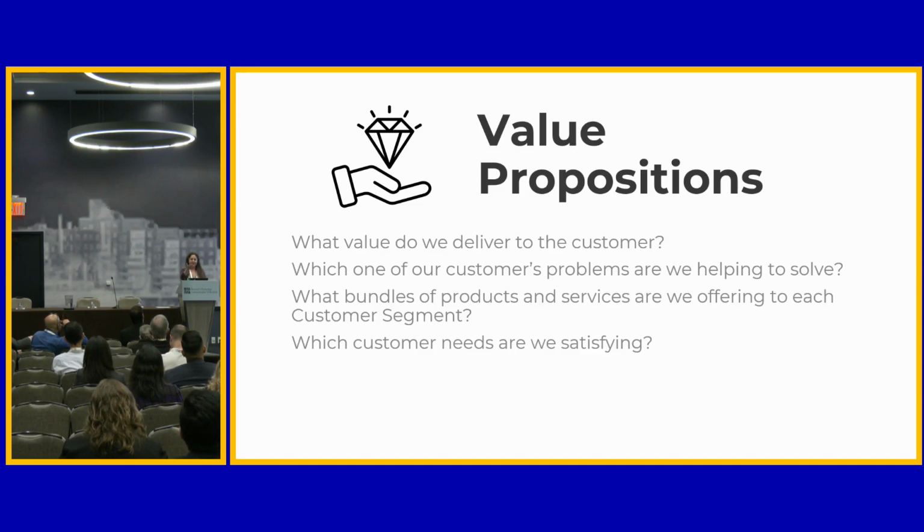We were talking about this, Barry and I, about how a product team and a services team really have to work closely together. If all of your customers or prospectives are coming in and saying, I really want to do biofluids, then you might be doing a better service, instead of turning them away with maybe disappointing results from your mass spectrometer, saying, I can't do that throughput.